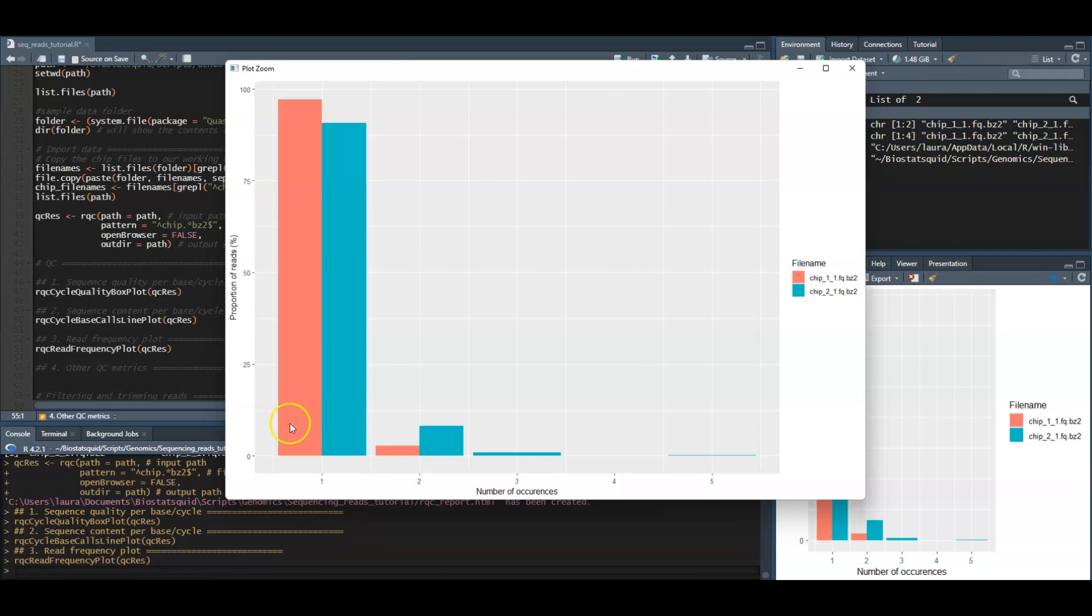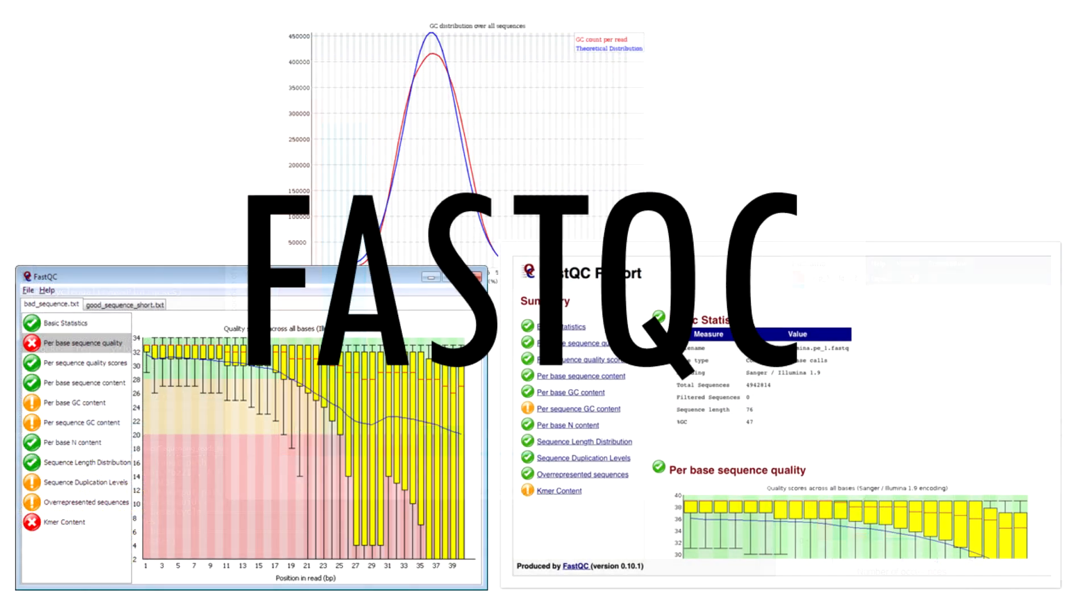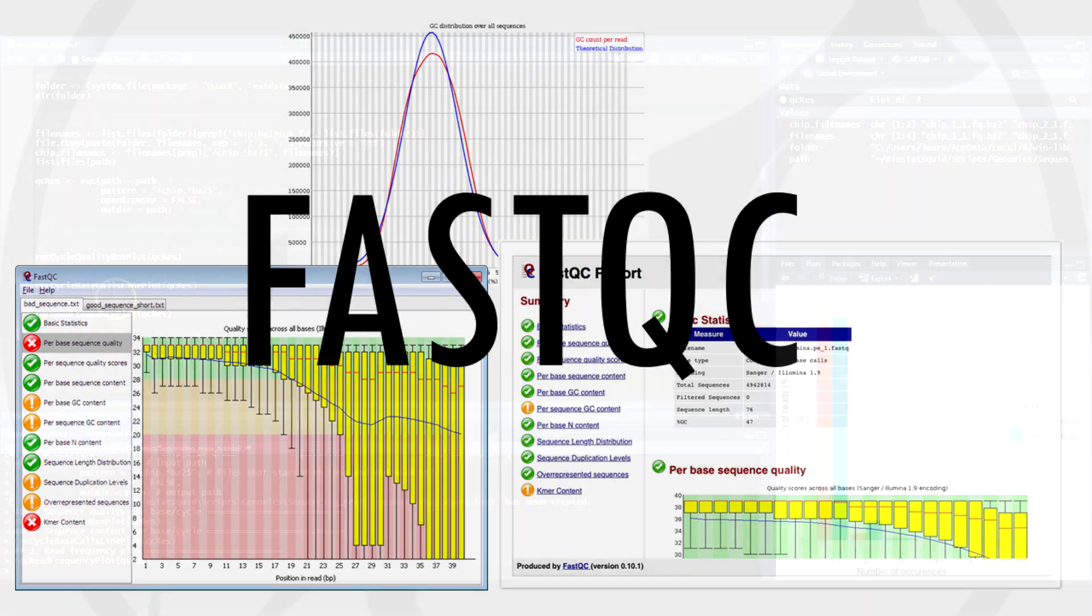Of course there are other quality metrics and quality control tools, and again this is only a guide for standard whole genome sequencing samples. There will be different steps if you are analyzing RNA-seq, bisulfite, amplicon, transposase, ATAC-seq, or many other data types. I would also like to mention FastQC, which is the most popular tool for sequencing quality control, but that is a story for another video.